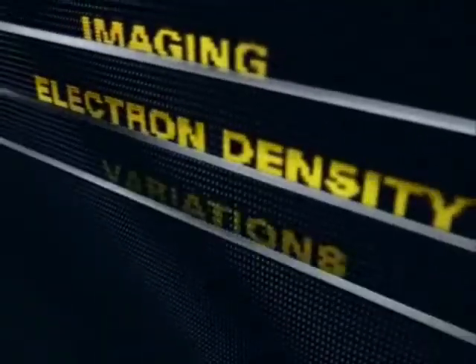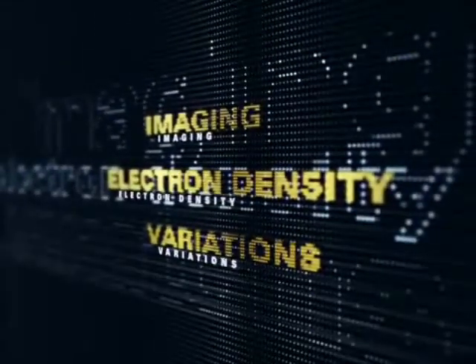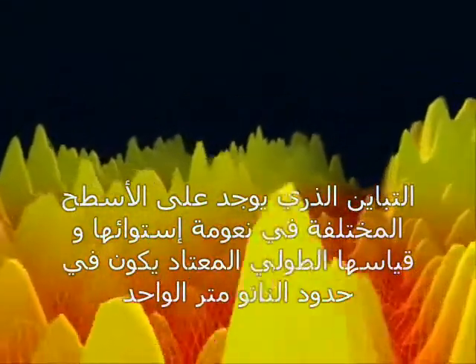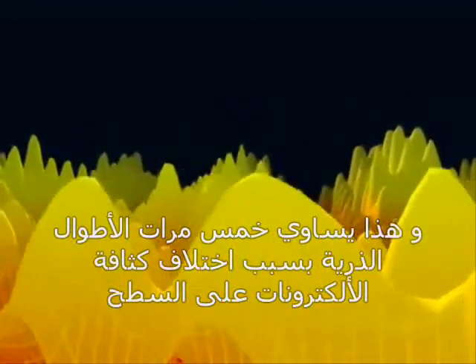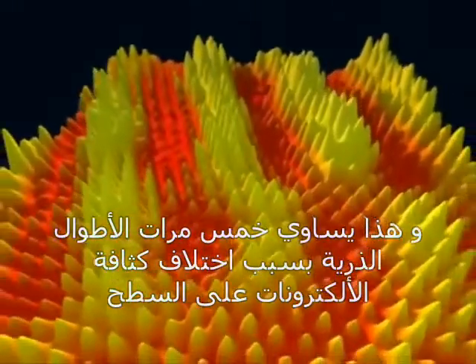Imaging electron density variations. The atomic contrast resides on smoothly varying background. Typical modulation lengths are of the order of 1 nanometer, 5 times as long as atomic distances, and they're due to variations of the electron density within a surface.